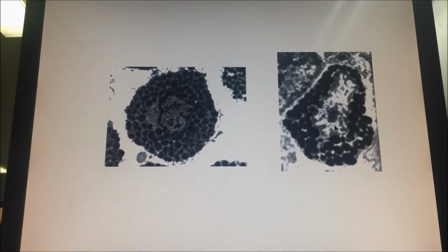نفس الشيء هون الخلية واضحة central nuclei محوطة بـ a large amount of electron dense granules. الماست cell usually بتكون around the blood vessels in the connective tissue. لأنه الميدياترز اللي موجودين بهدول الجرانيولز they mainly affect the blood vessel itself. يعني الهستامين مثلا بيعمل vasodilation وبيزيد الفاسكولار permeability وهو مسؤول عن كل السيمبتومز تقريبا تبع الانفلاميشن الإديما والريدنس والسترا etc. لأنه الافكتس تبعونهم كله على البلد فيسل.